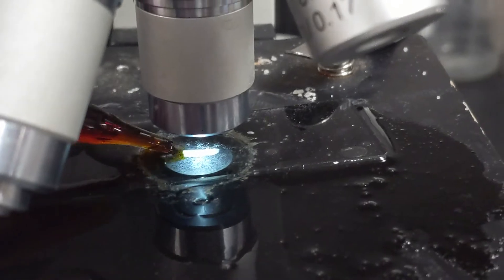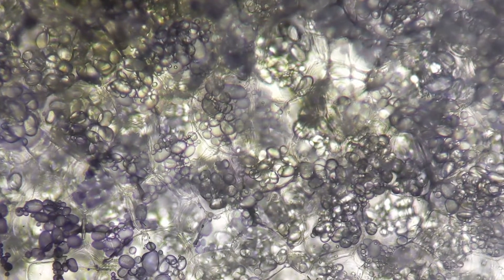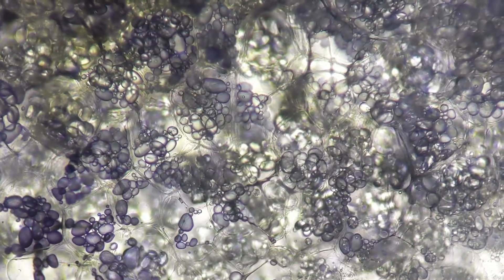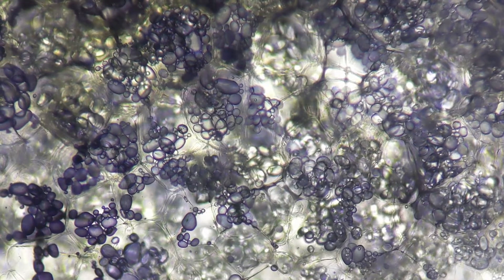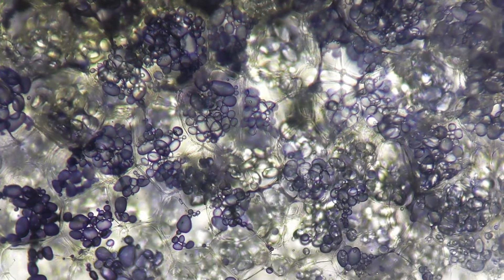Cell walls, cell membranes, cytoplasm, and then these membrane-bound spaces — these organelles where starch is stored — called leukoplasts. You might recall that the addition of iodine to starch causes a color change, and this chemical interaction will stain midnight blue or purple. So I've added the iodine to the potato, and now — this is real time, this is not sped up — I can see the iodine flowing across the cell wall, through the cell membrane, through the cytoplasm, and then through the membrane of the leukoplast, staining that starch a beautiful midnight blue or purple. It also reveals there is no starch in the cytoplasm, and you can see the clear spaces around the leukoplasts within the cell wall. The starch does not escape the leukoplast, but the iodine can readily diffuse from high to low concentration through the cell membrane and through the membrane of the leukoplast.